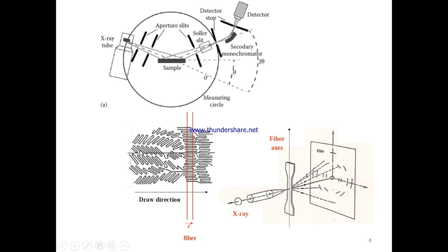Here you can see the kind of molecular arrangement inside the fiber structure. This kind of molecular arrangement you are already familiar with, as you have gone through the various fine structure models. Now if this is the scanning direction shown by the red lines, here you can see there is a rigorous folding of molecules. As I mentioned, when there is a folded configuration of the molecule, that zone is the crystalline phase. So if this is a crystalline phase, it will give you a diffraction spectrum in the form of rings, like concentric rings.